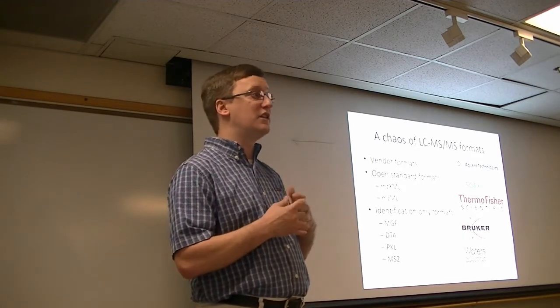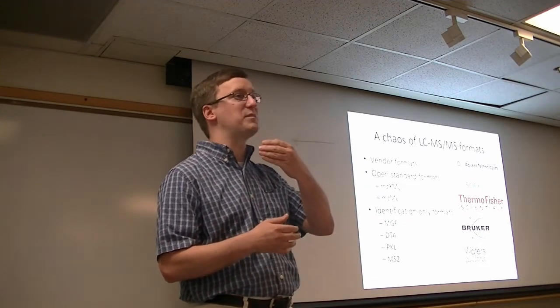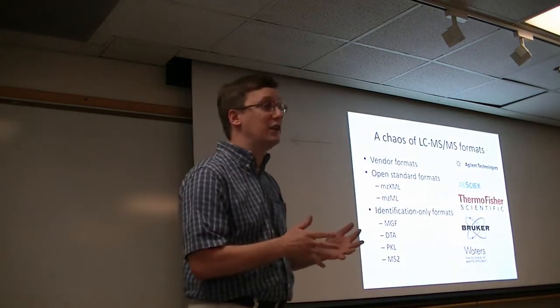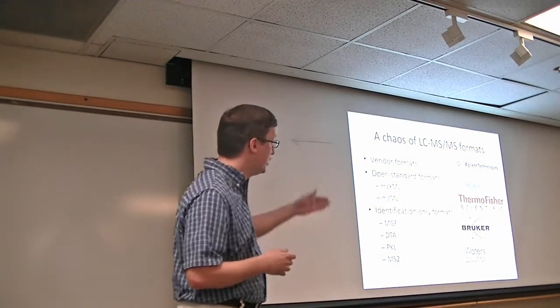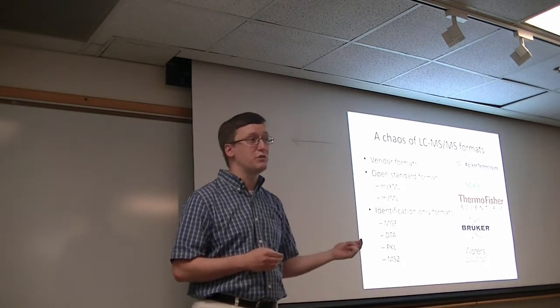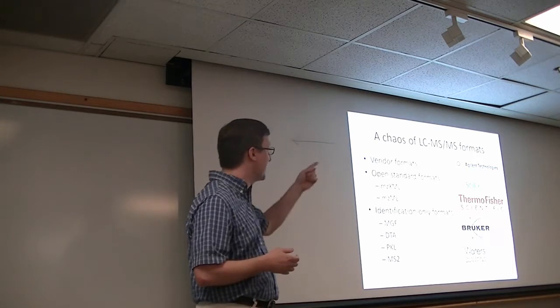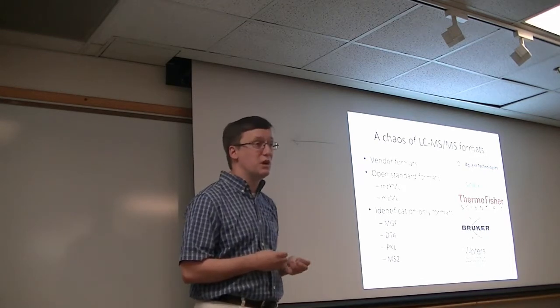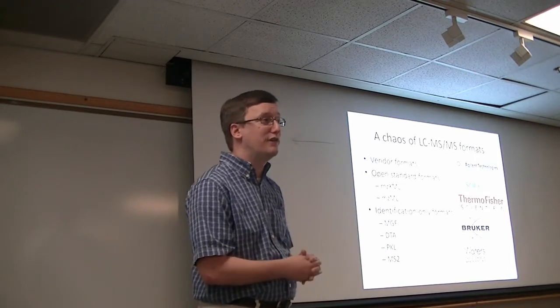So we started in the usual way with the instruments we're most familiar with, Thermo Fisher, for example. And the developer with my team used some of the code that had been created at the Institute for Systems Biology and refined it quite heavily to create the ProteoWizard reader for Thermo. And along the way, lots of other vendors have decided that being included in ProteoWizard is a priority. We've actually had funding support from companies like Agilent and Bruker and Waters as well to create readers that work very, very well in their file formats.